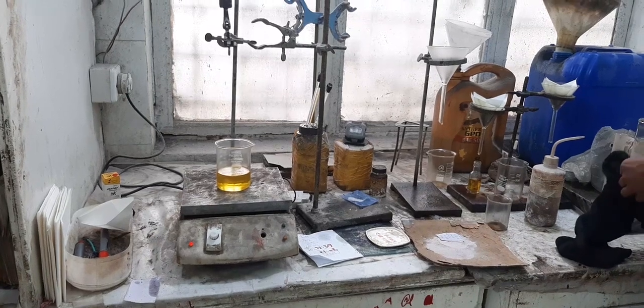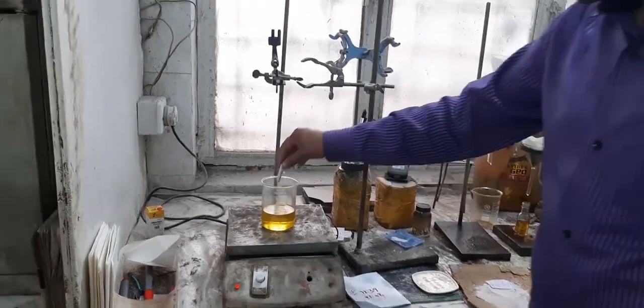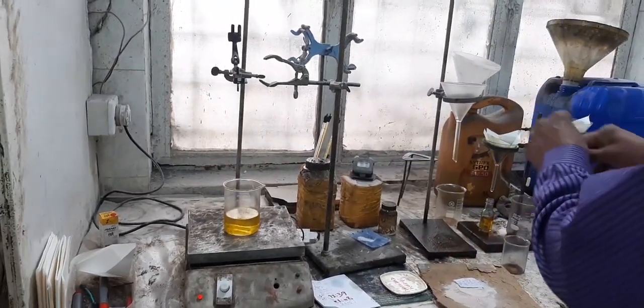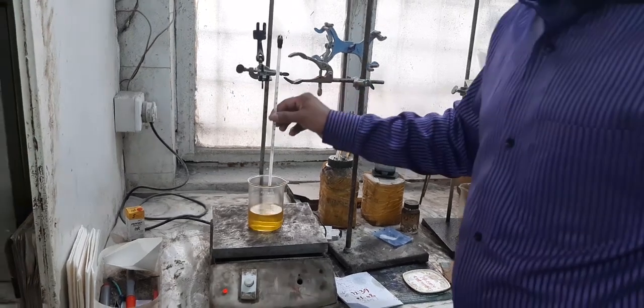Next, we'll place the oil on a hot plate to heat it. Heat the oil to 100 degrees Celsius while continuously stirring.